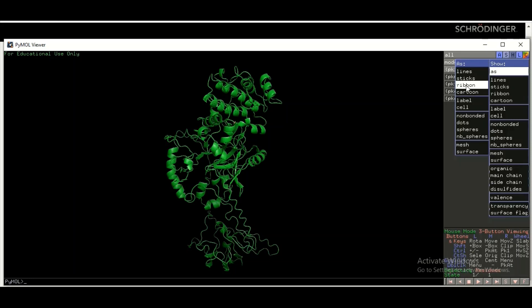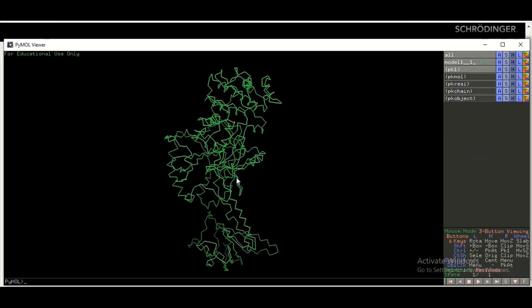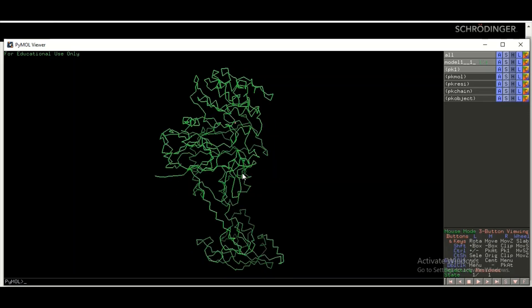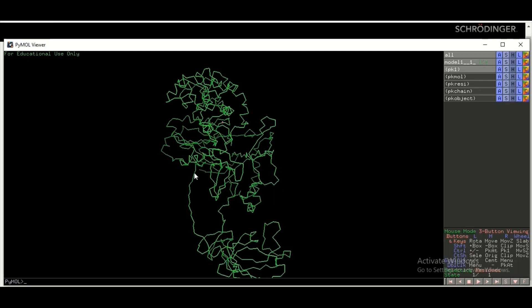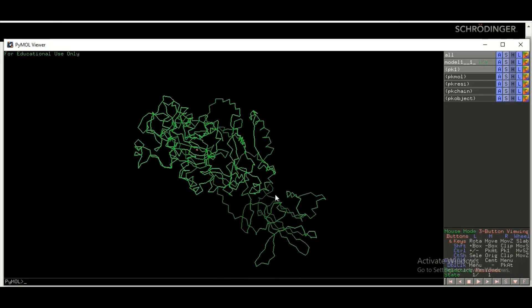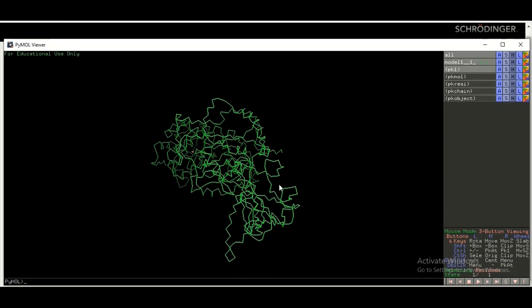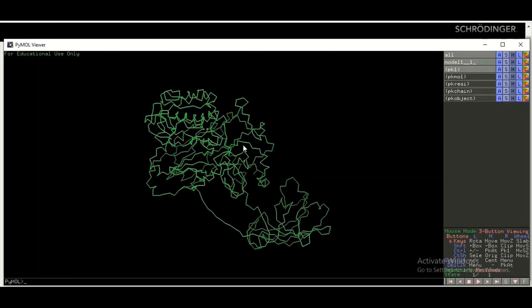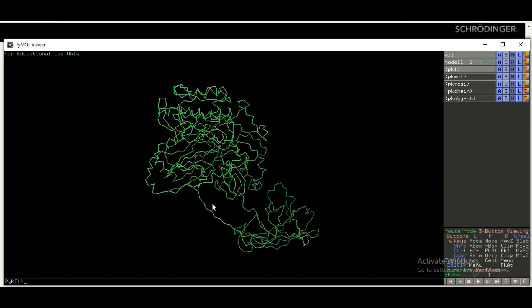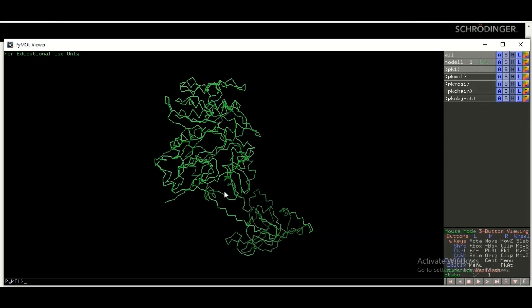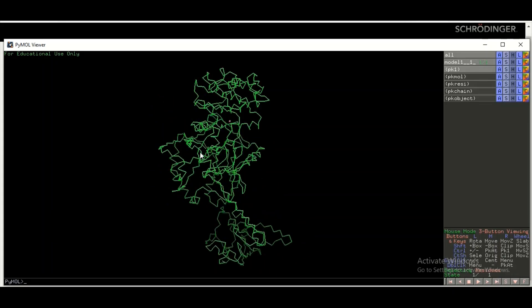If you are interested in a ribbon form of the three-dimensional structure of your protein, go to S, then Show, then click on Ribbon. In this ribbon form there is just the backbone of the three-dimensional structure of the protein.